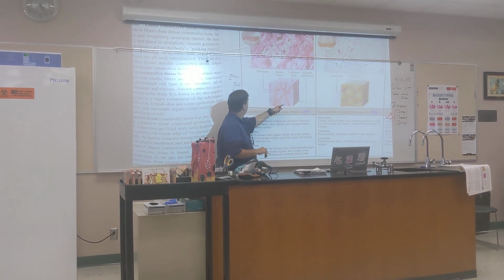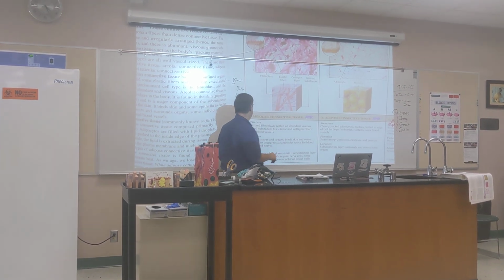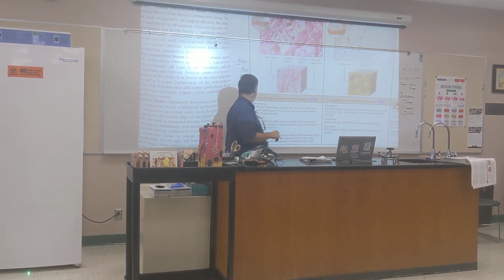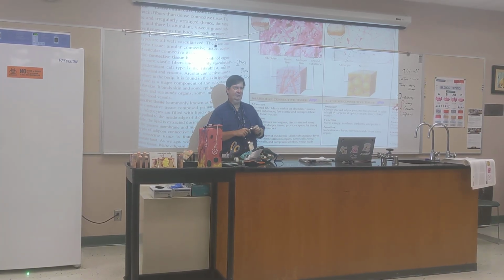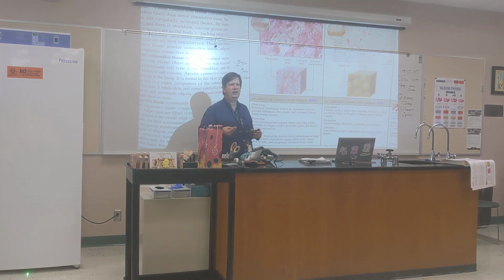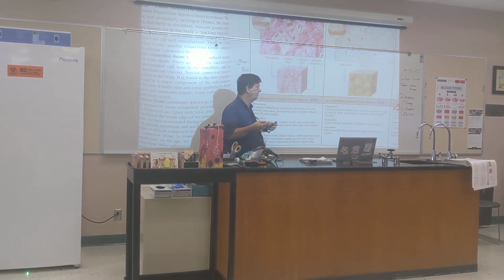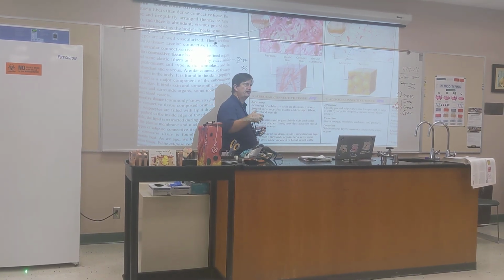And you can see, both in the drawing and the picture, we've got a whole bunch of those specialized cells, right? And what are they going to be doing? They're going to be making substances, where it says here that the areolar connective tissue shows abundant viscous ground substance. Think of it as being like a jelly, okay? When we talk about viscosity, we're usually talking about things like how thick the oil in your car is. I know I'm not supposed to talk about cars. Well, if it's a really thick fluid, like a jelly, does that make sense? So it's got some give to it. It's not solid, like bone. So ground substance doesn't have to be solid.